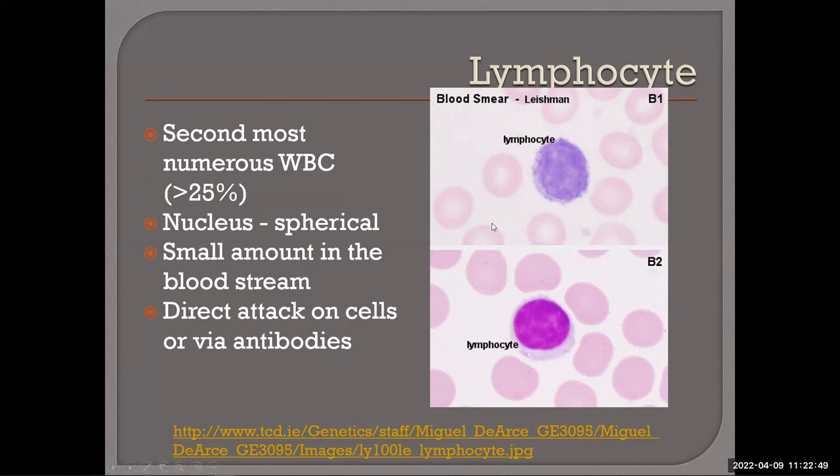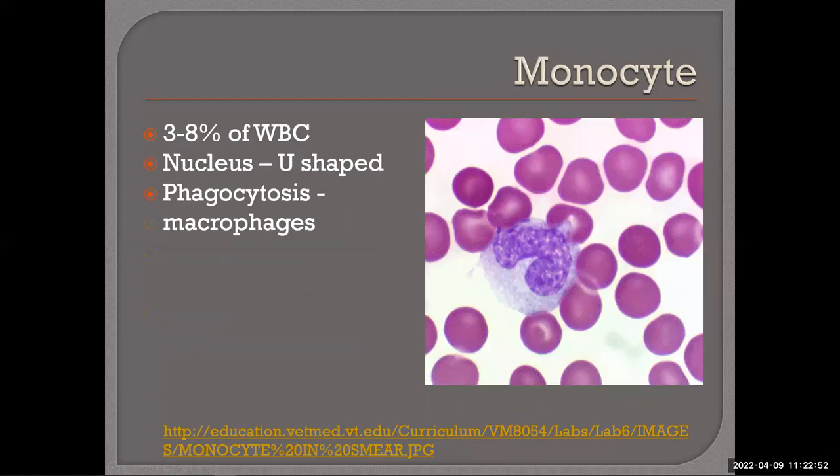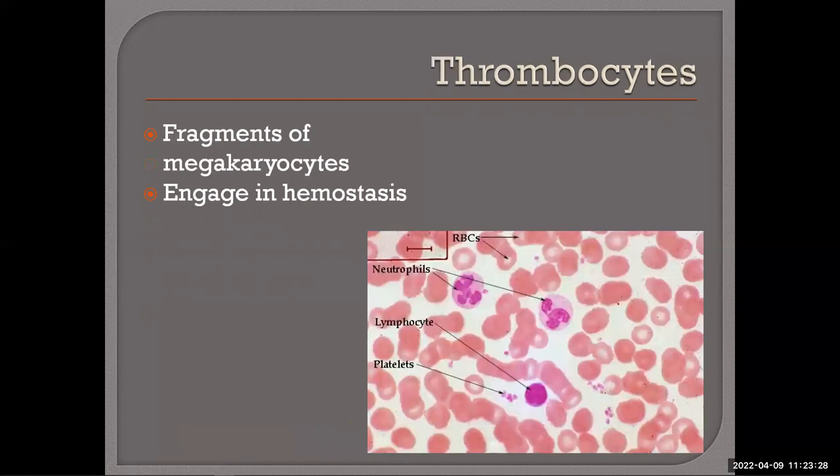So now let's look at the other one, L and the M. LM, remember they follow sequentially in terms of the alphabet. Once you think about lymphocytes, the other one is M, monocytes. These are the phagocytotic ones. They're Pac-Man. They have a U-shaped nucleus and they are very large. Relative to a red blood cell, it's almost about the size of three red blood cells. Being phagocytotic means they move like a Pac-Man. They eat, chomp, chomp, chomp.